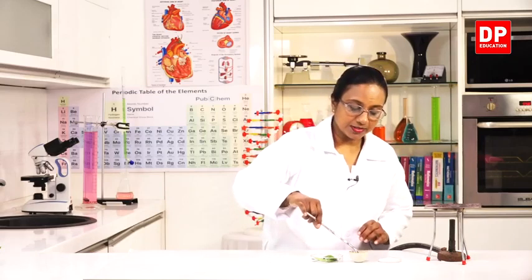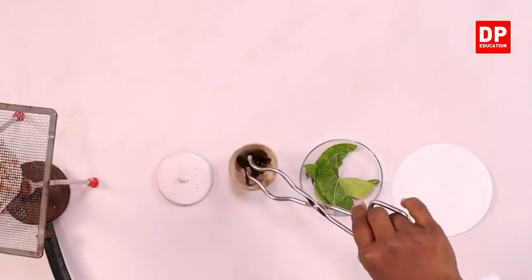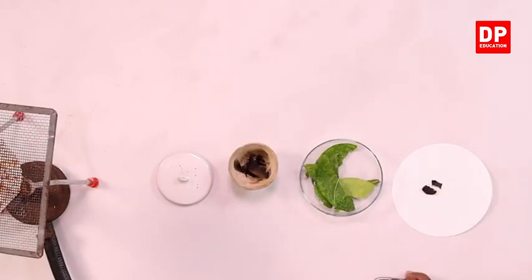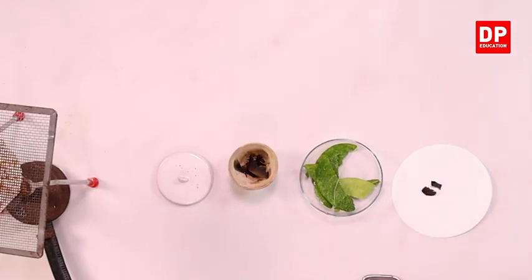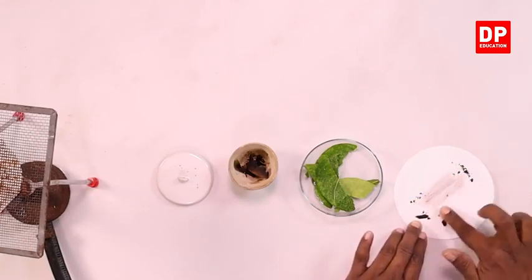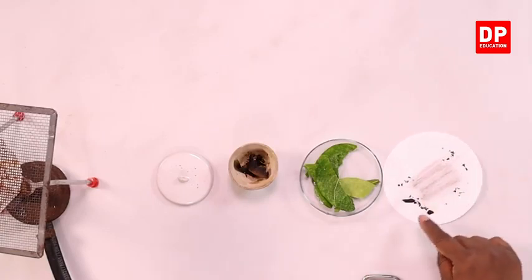I think by now the sample must have cooled down a bit. I will take out the most blackish color parts, place it on the paper. You have to make sure it is not hot. Then I will draw some lines with this. Here you can see clearly that there are black colored lines being drawn on the filter paper.